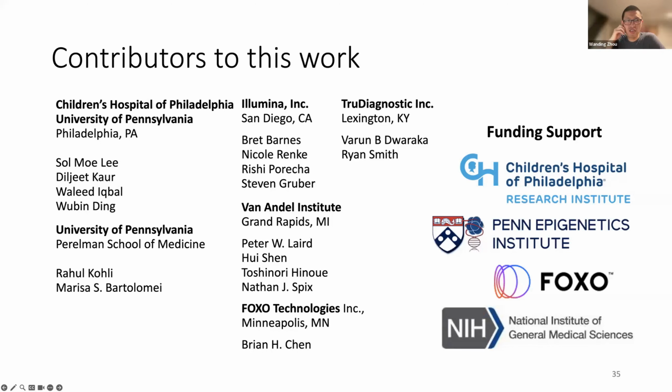Yeah, actually, this is a great suggestion because this is something that we are thinking about as well. Right now, the calibration has not been systematically done on the arrays. From the community side, I'm sure that Illumina has done lots of calibrations internally. Part of the challenge is that the arrays have some intrinsic shortcomings. For example, you will never be able to get a good quantification of the extremes, like 0% and 100%, due to the presence of signal background.